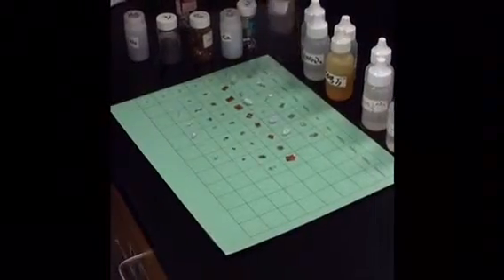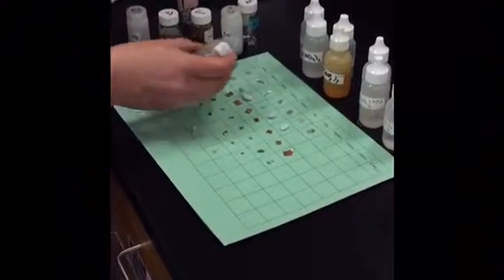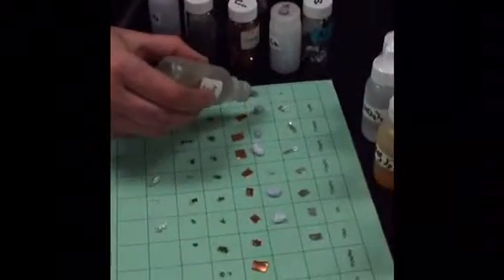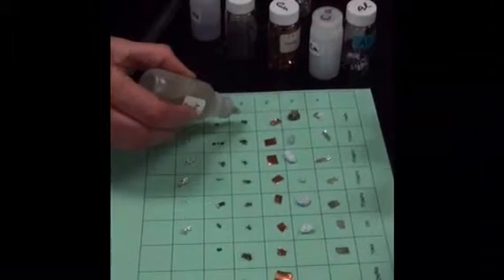Those are in place. Then you're going to use the droppers, and going down the column you're going to put a few drops on each metal and record what happens.